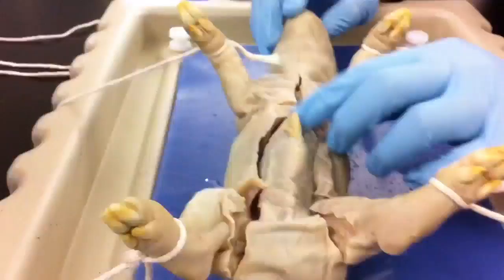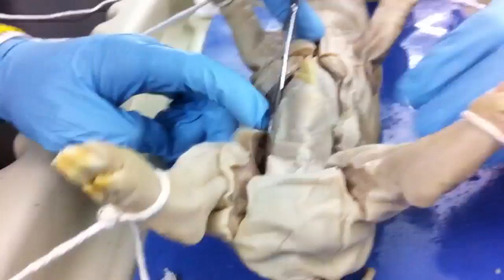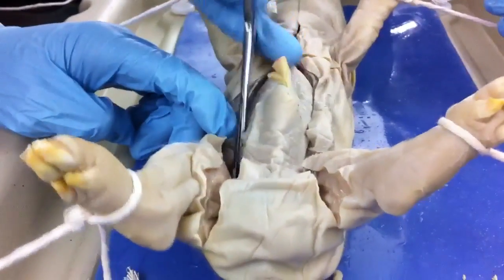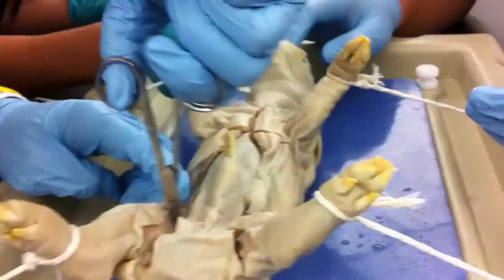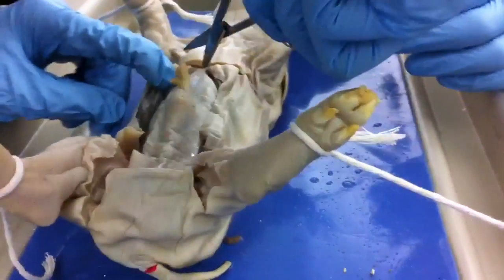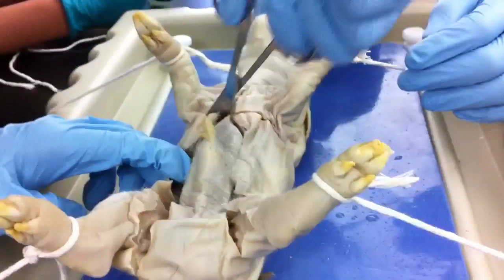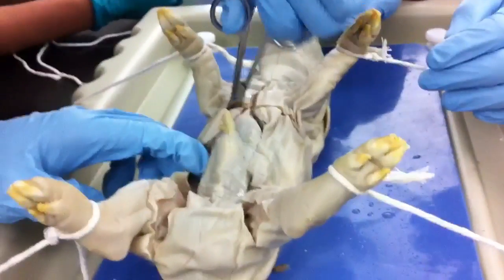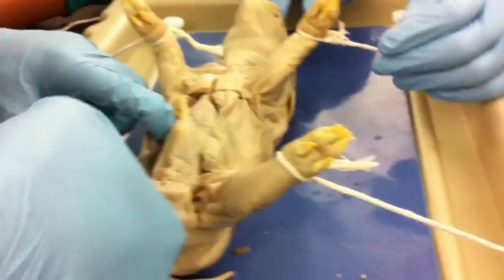I remember it popped open. It smells worse than the starfish. I'm going to start this. Maybe just let them die. It smells like fat fish. Oh, how does that feel? It's great. Oh, Jesus Christ, guys.